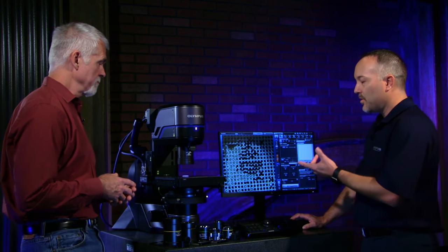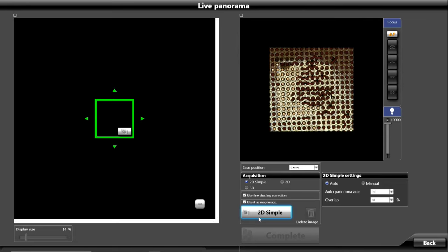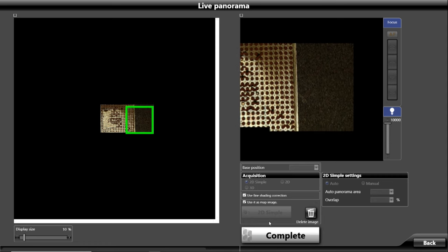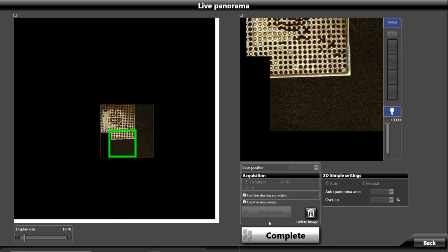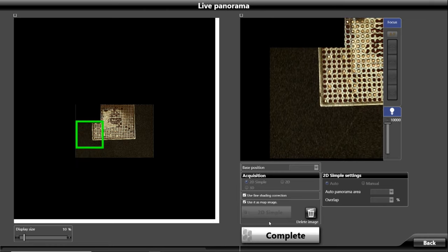We're looking at our little ball grid array part on our screen here at 20 times magnification, and we have a lot of working distance under the objective lens. So if your part has a lot of topography or big components on it, we can still image down into things. What's great about this low mag objective in the software is we can do a quick live panorama. All I do is hit the button for a 2D simple panorama, and it moves the stage in X and Y and stitches together the entire overview of our part.